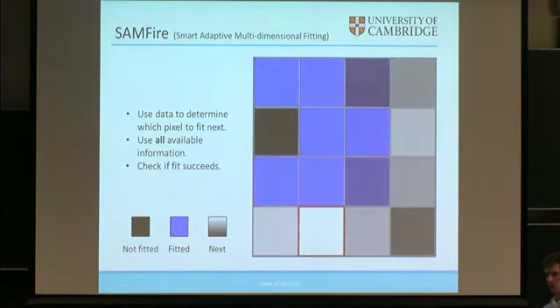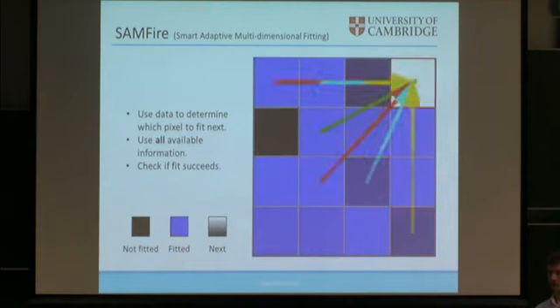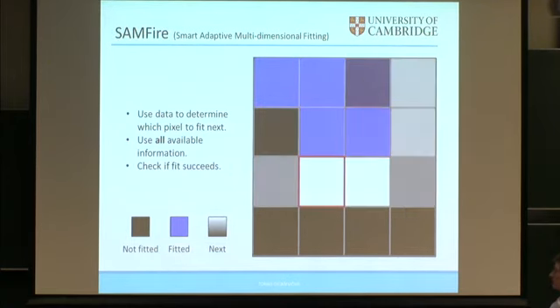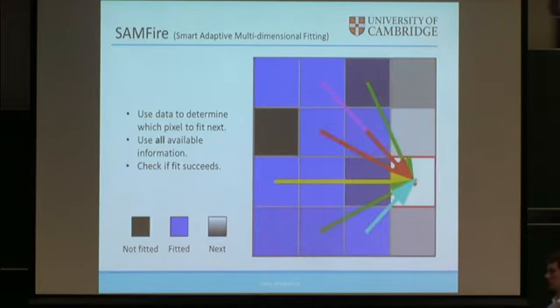So it's not just one pixel, the last value that we used to solve the problem. Instead, we use a local average that's weighted depending on your problem. As you can see, there's one pixel, this one, that just failed to fit, and it's fine. I mean, it reverts to the not-fitted state, so to say, and it doesn't propagate, and it's not a problem for us at all.